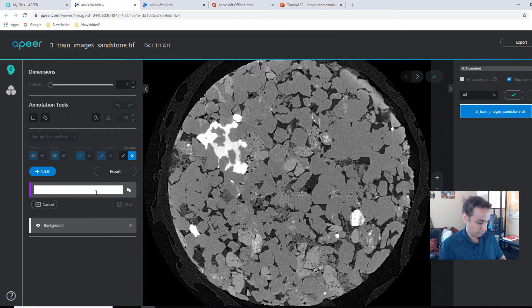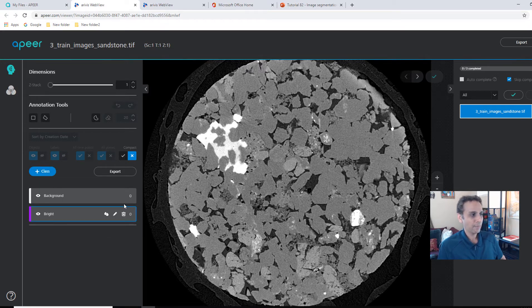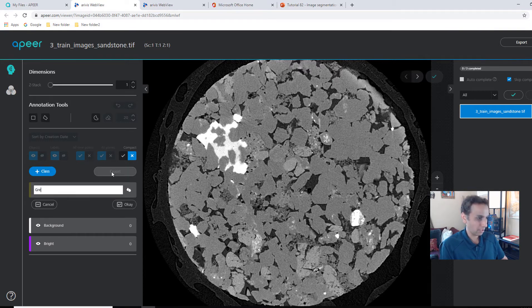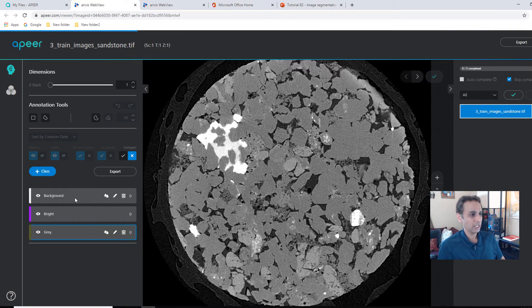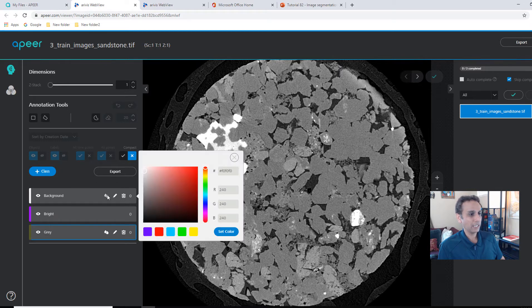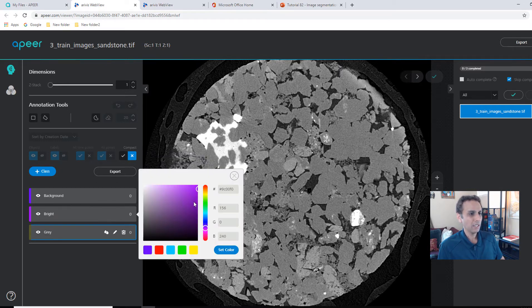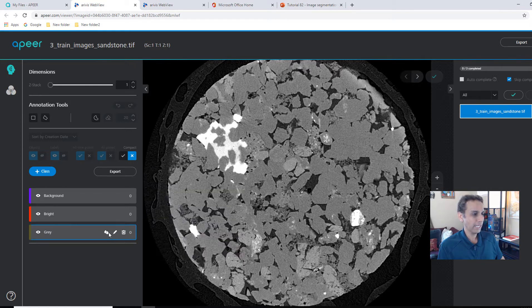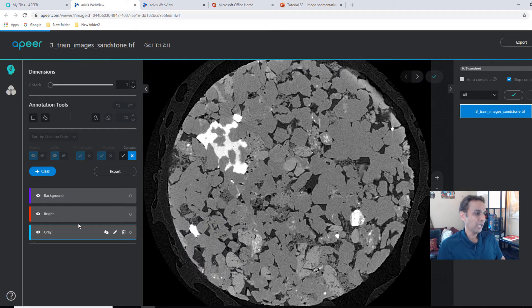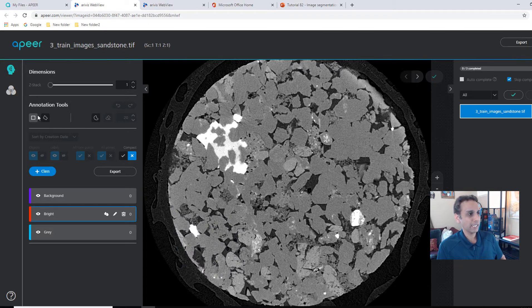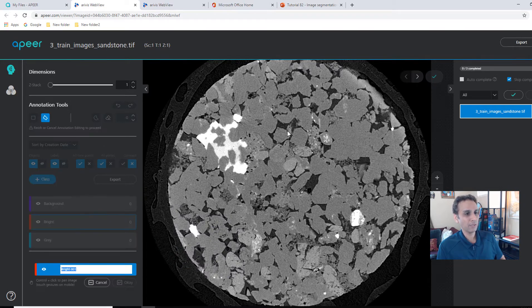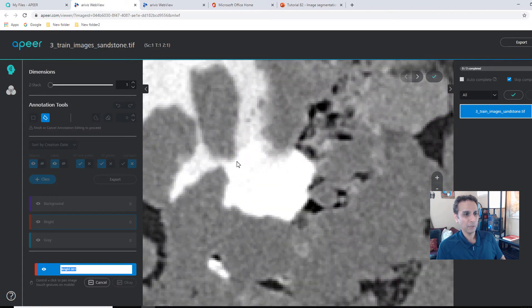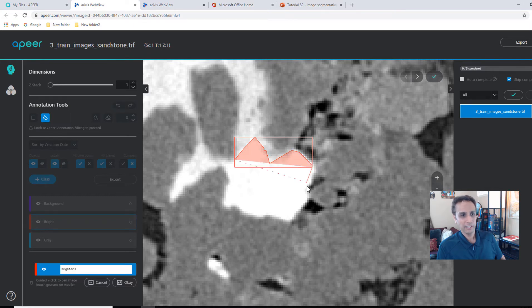They get added here. And once they're added, you can visualize them. Remember this eye icon will open it up just for preview. And this pencil opens it up in annotate page. So if I click on this pencil thing, it opens it up into a page that looks like this, where I can add different classes. So I can say this class is background. The next class I want to add is, I don't know, bright regions. And the next class I want to add, that's just gray.